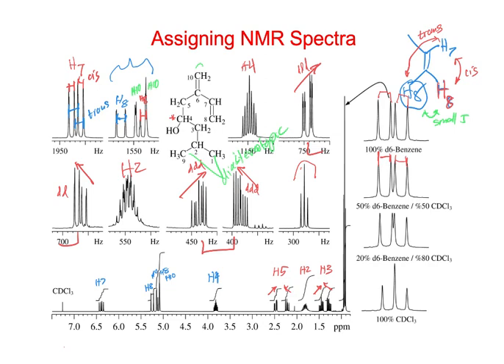Intuitively, I would have thought that if you varied the solvent, the shifts would become more equivalent. But obviously that is not the case.